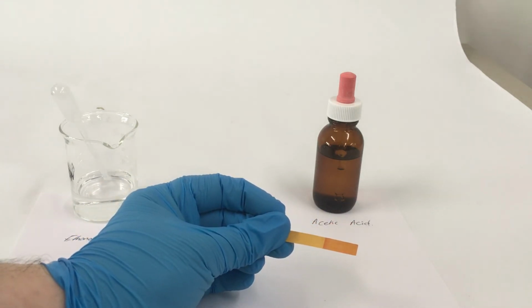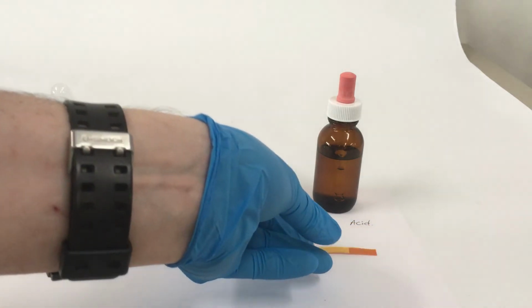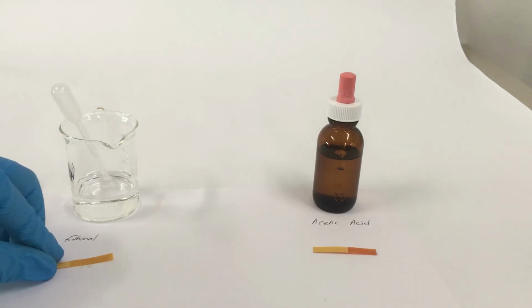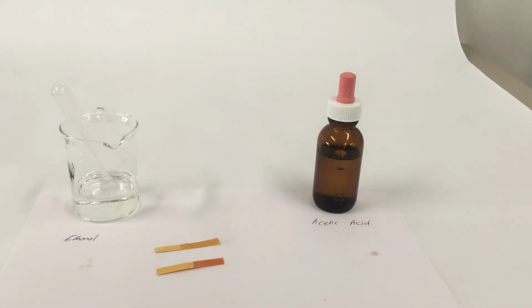So it's not particularly strong, but it is definitely registering as acidic. So we'll give that a few seconds to develop. Now for a comparison, you can see that the acetic acid on the bottom is a lot more acidic than the ethanol.